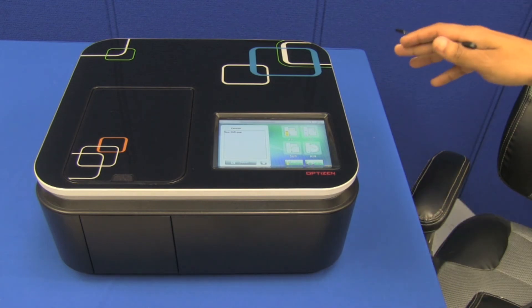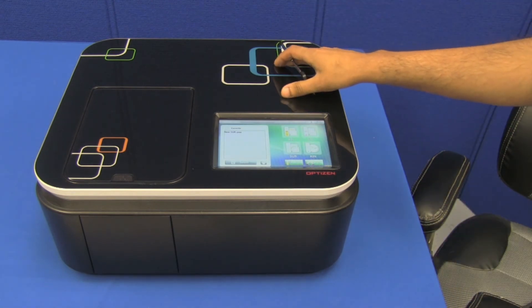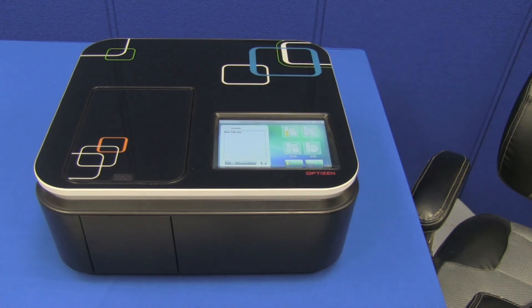The hard drive capacity on this system is a standard two gigabytes, but it is expandable to eight gigabytes if needed. The tungsten lamp has a life of 2,500 hours, which is two years, and it's warranty covered — so if anything goes wrong in that time, you're covered under warranty.